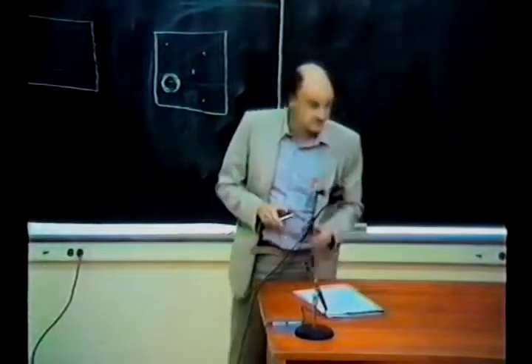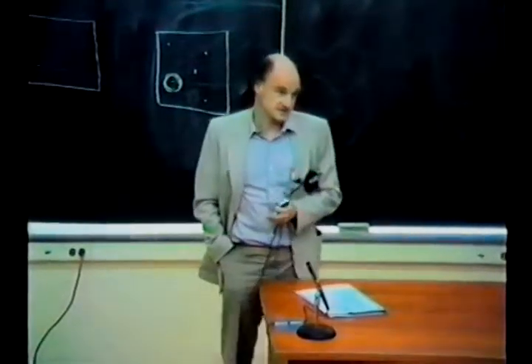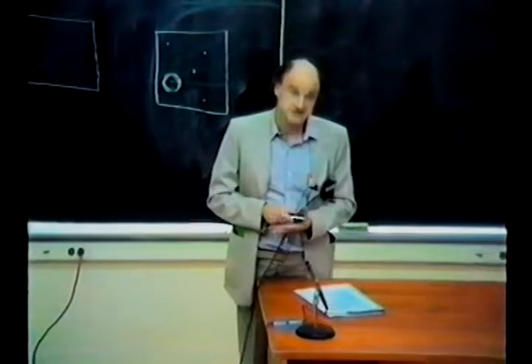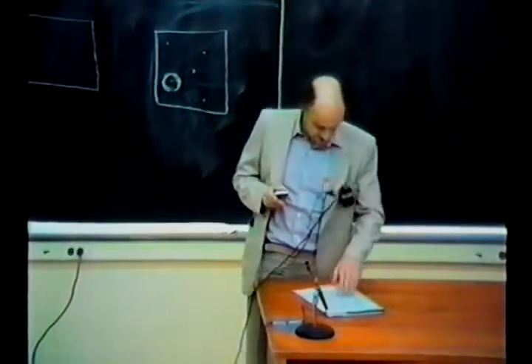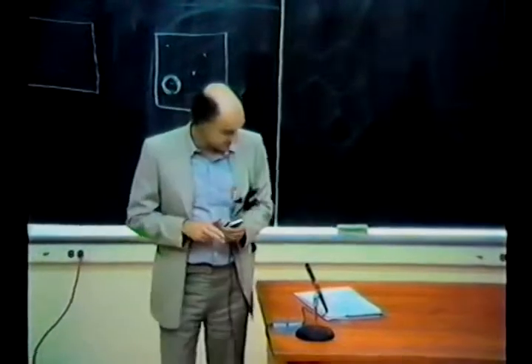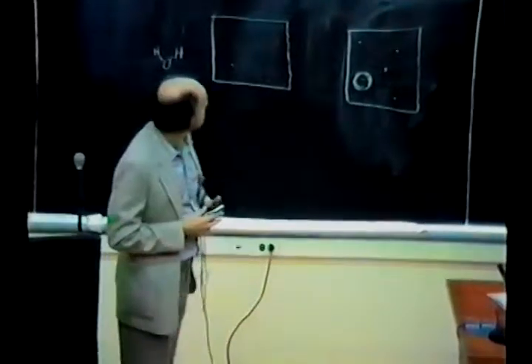This paper then has very close links with Peter Hall's talk already this afternoon, and also has links with the paper by Dr. Adkins this morning, who talked about packings of spherical silica particles. In many respects, the structures we'll be considering are made up of packings of uniform spherical silica particles in going from a sol to a gel. So we have the first slide.